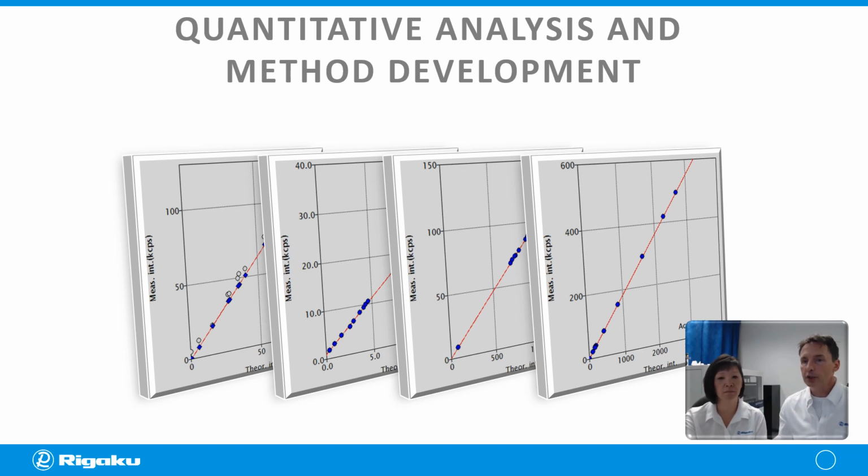Okay, so that should give you a good general perspective of how XRF works. Obviously, there's a lot of little details to it, and we teach all those kinds of things in schools, but it's pretty easy, and you don't have to actually worry about all that to run a sample, to run a method. You just think about it as another detector. And Thanh came in here from a mass spec background, at first she's like, well, I don't know anything about X-rays, but it's an analytical technique. So it's like any other analytical technique, it's just a different detector.